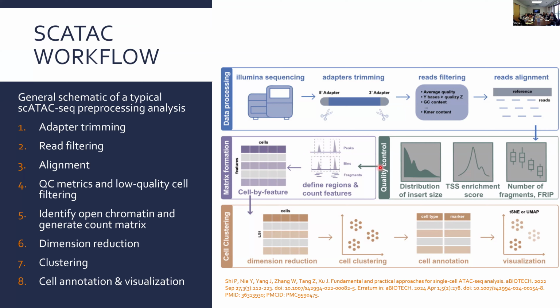And then the fragment size distribution, the peaks actually represent nucleosomes. So over here is nucleosome-free fragments. The first peak is a single nucleosome. The second peak is dinucleosomes. And if you actually expand it out, you can see 3, 4, 5, 6 nucleosome fragments where they're coming from. And generally, in my experience, this kind of looks good, and you're moving on. There's no value here where you say, ooh, it's below a certain value, I've got to get rid of that sample. So the utility of this feels more like it's only bad if you don't see the peaks.